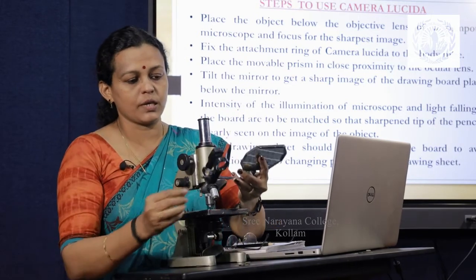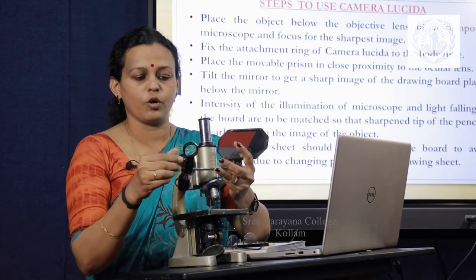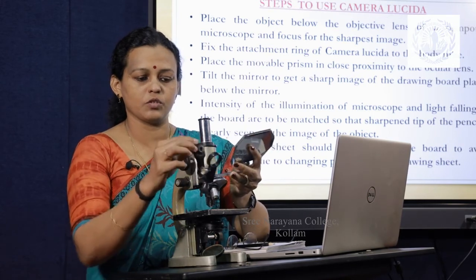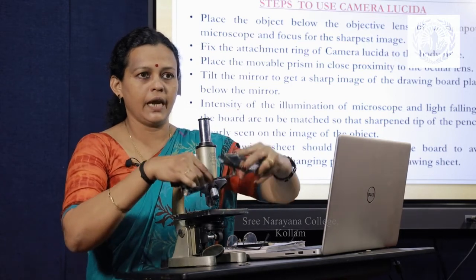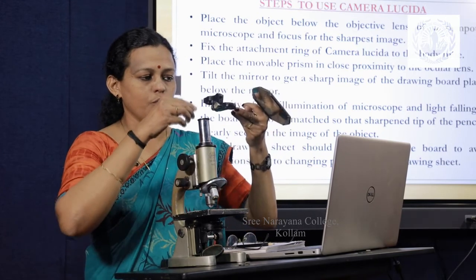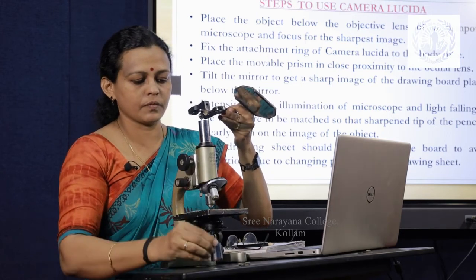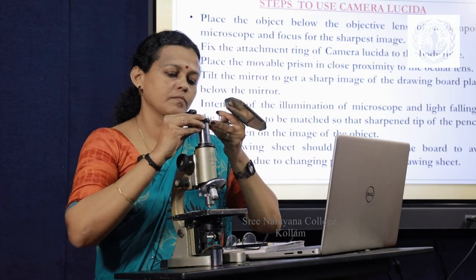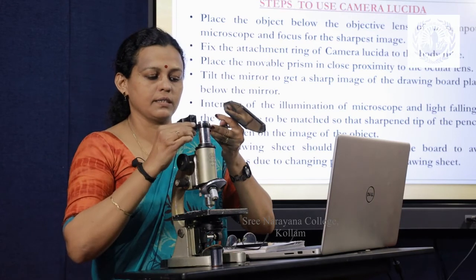Here you can see this is the attachment ring. Here you have a knob for adjustment. Then here this is the prism, which is movable, and here you can see this is the mirror. It can be inclined. Here first you remove the eyepiece or the ocular. Place it, take the ring in and tighten it.